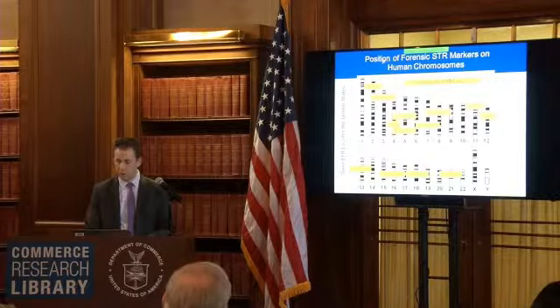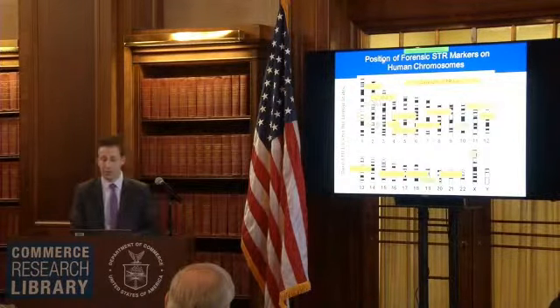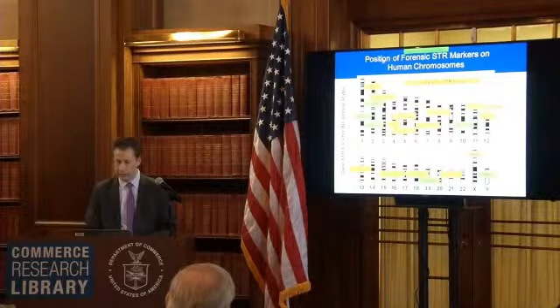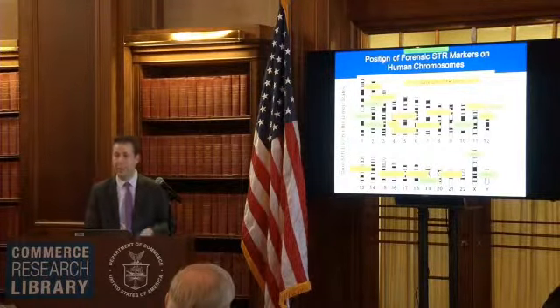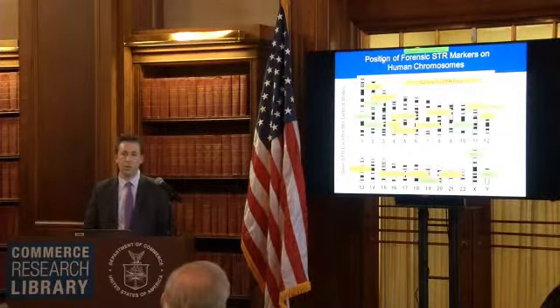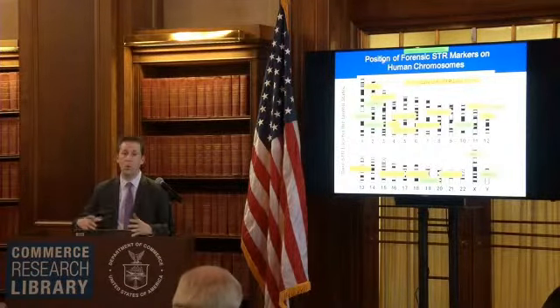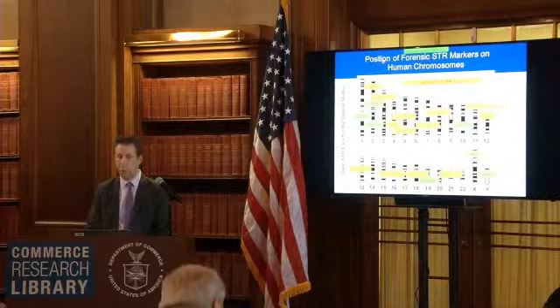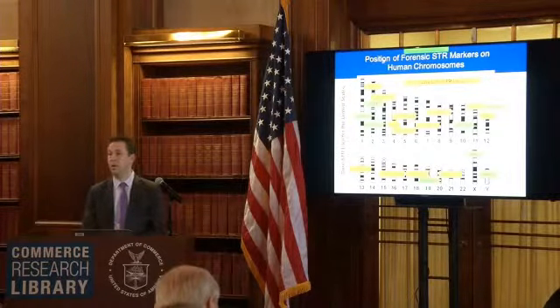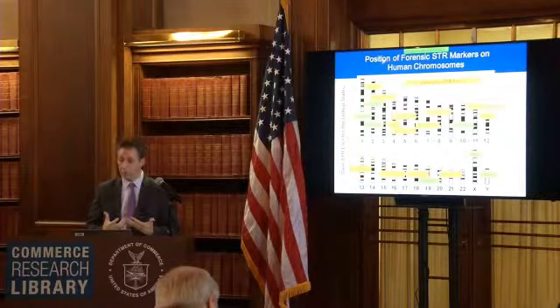Right now, the US is in the process of increasing the number of markers they're using. The ones I've highlighted here in green are now going to be added to the 13 to equal 20 total core markers for the United States. So in the next year or two, labs doing DNA typing will have to submit all 20 of these markers to the database. The reason for increasing them is giving higher levels of discrimination.